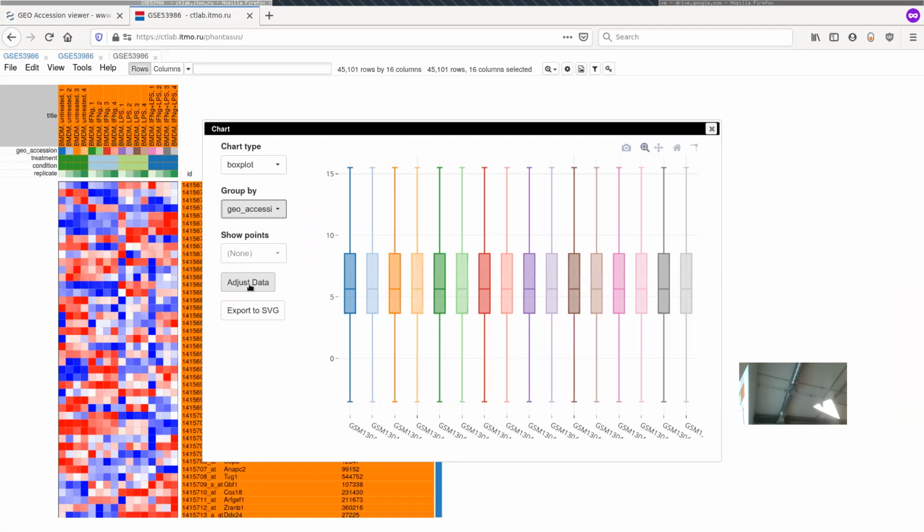So now, if we see that some gene is upregulated in the light blue sample, for example, compared to dark blue, we can more strongly believe that it's indeed a biological effect and not just some technical variation because we had a higher amount of sample in that particular well. Okay.